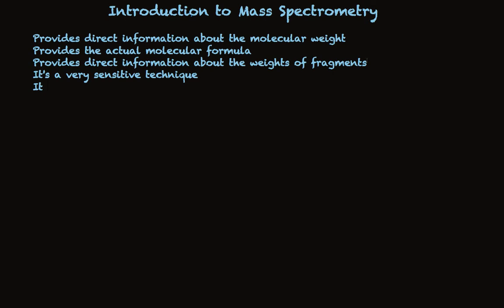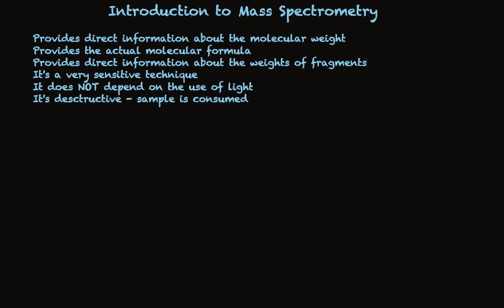It does not depend on the use of light, which sets it apart from the other instrumental techniques that we'll talk about. It is destructive. The sample that's actually looked at is consumed. And importantly, for some applications, it's worth noting that the actual examination by the instrument is done one molecule at a time, or more specifically, one ion at a time.